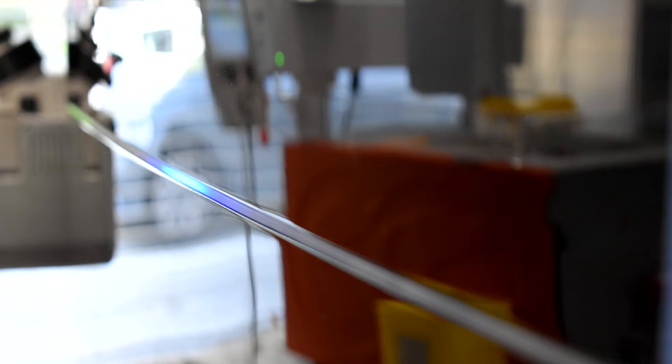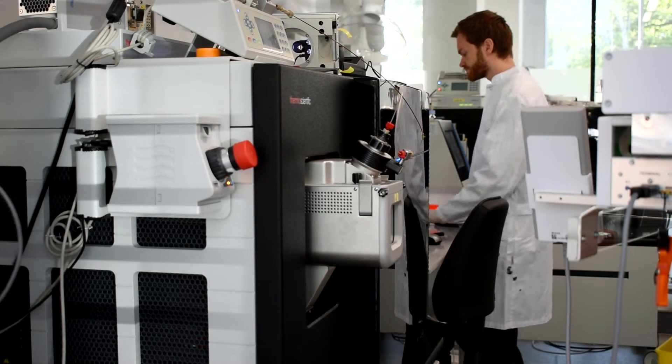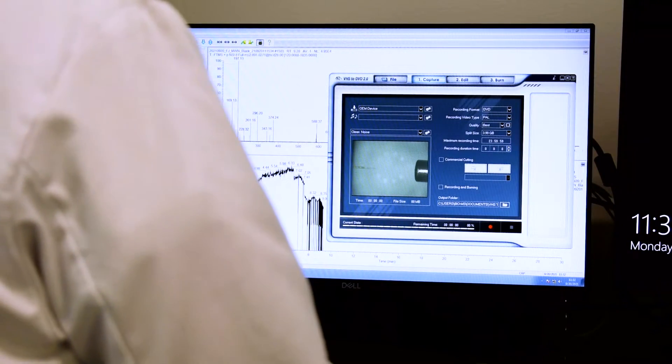Due to the unique setup of this instrument, the versatility for a wide range of proteomics workflows is really unique. It comes equipped with ETD, which we can use for both top-down analysis, for phosphorylation analysis, and glycoanalysis. Combined with the HCD fragmentation, you can even do ETHCD. So this instrument is really a highly specialized one that can be used where needed.